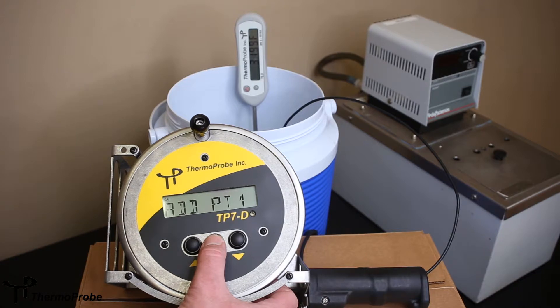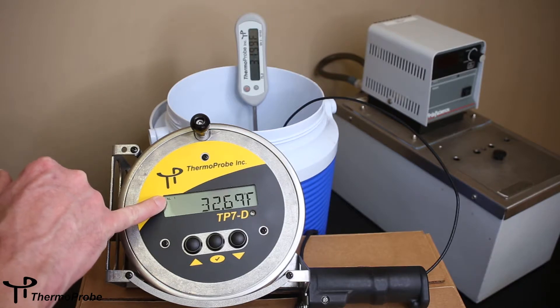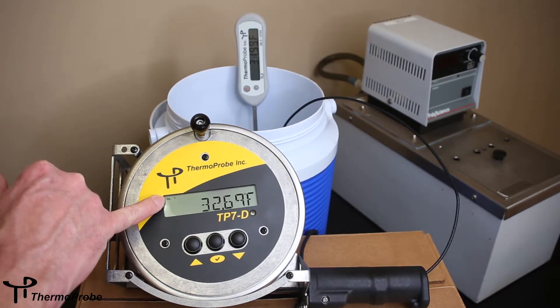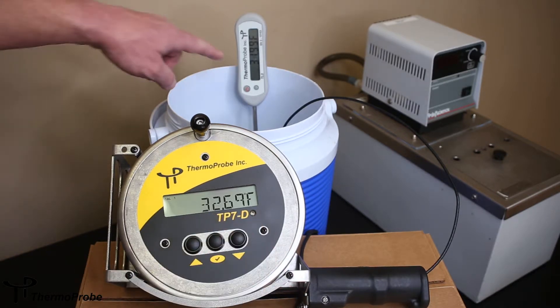So I'm doing a freezing point, so I'll add point one. You can see that I'm in calibration mode and I'm doing calibration point one. At this point we need to use our up and down arrows to adjust our temperature readout to match that of our reference.